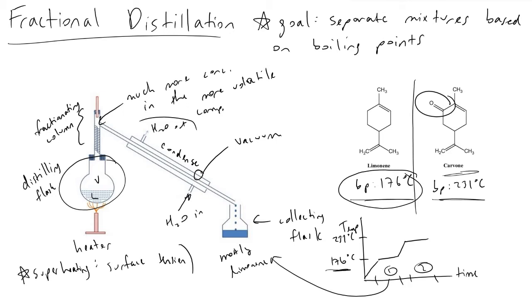So to overcome this, what chemists will do in labs is sometimes they will aerate this solution, the distilling flask, by supplying little bubbles to it, and they also use boiling chips, and the purpose of the bubbles and the boiling chips is to supply an area on which the little bubbles can actually form the vapor phase, where that vapor phase can actually be derived and where it can bubble up. And so that is another key thing you'll often do during experiments. And then this diagram, this little red thing up top, would just be a thermometer.